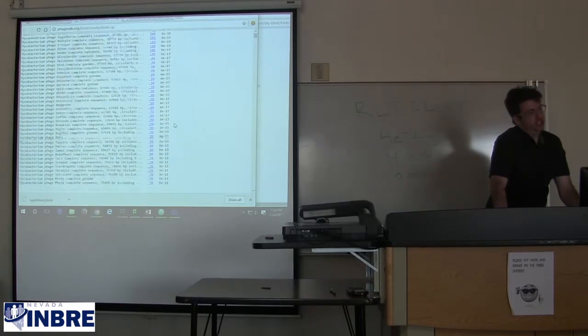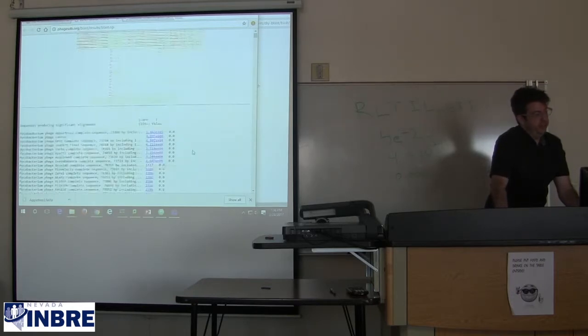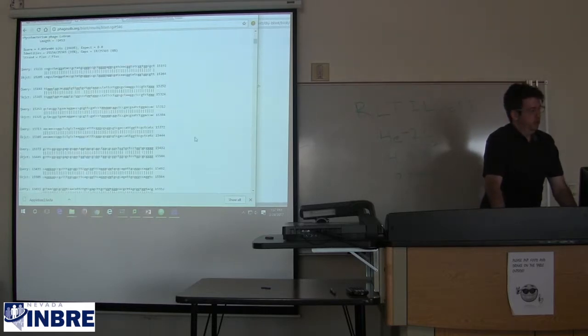To actually get at LeBron, which has a very good score as well, it's our second best hit, but should have some differences, we can go to it on the hit table and click that little hyperlink. We click that blue link for LeBron on its bit score, and we get moved to there in the page.